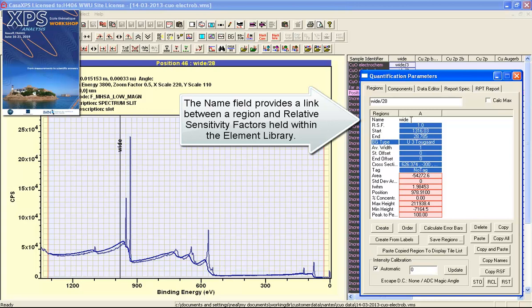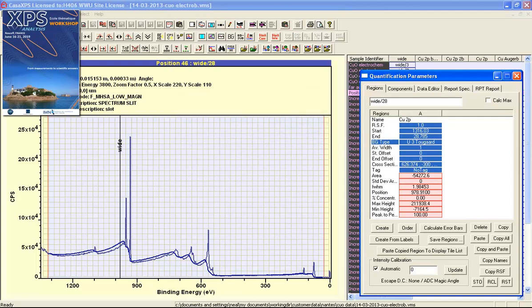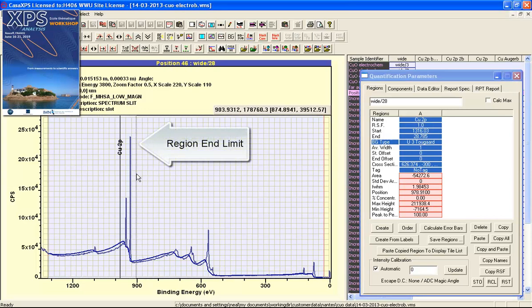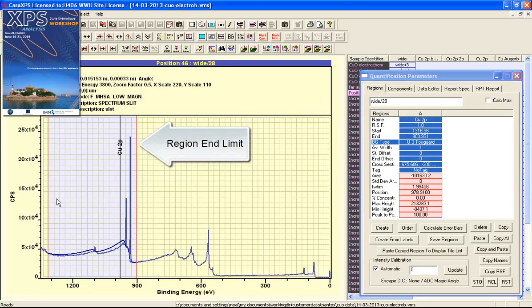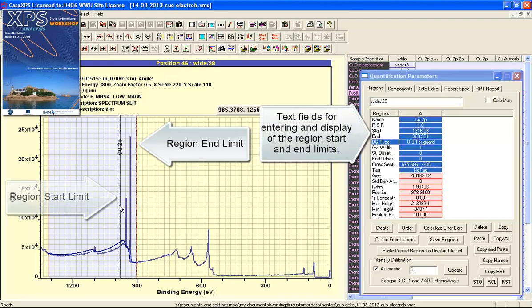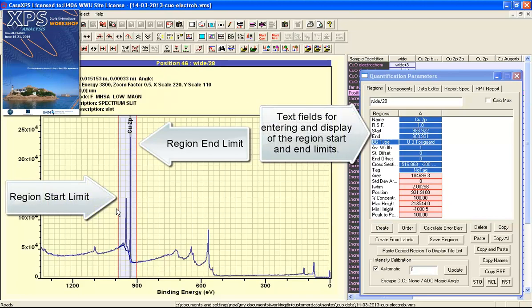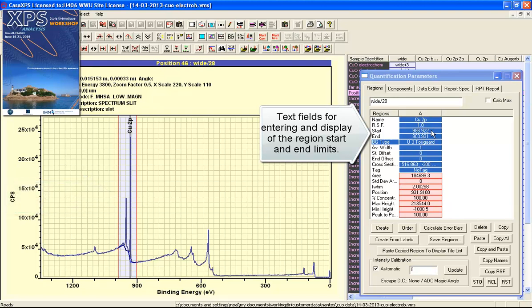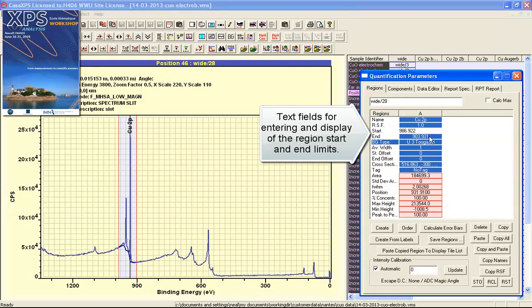The first thing we should do is indicate the peak that we would like to quantify. I have entered copper 2p, and I happen to know that these are copper 2p doublet peaks. I used the mouse to adjust the start and end limits, and these represent parameters here and here.